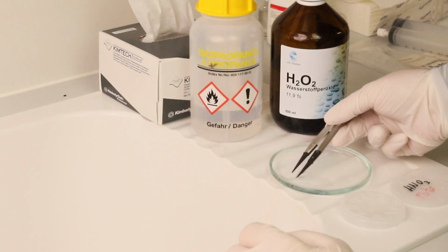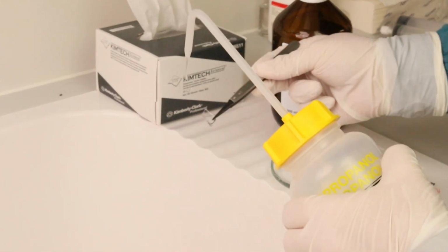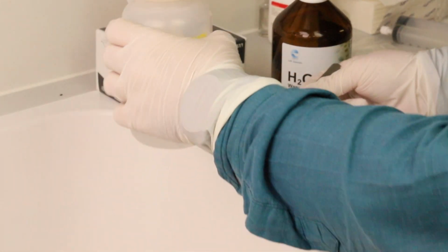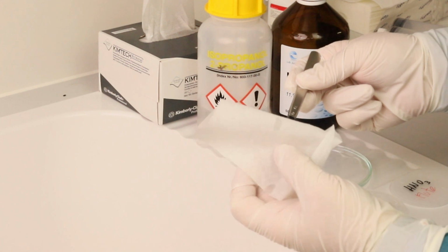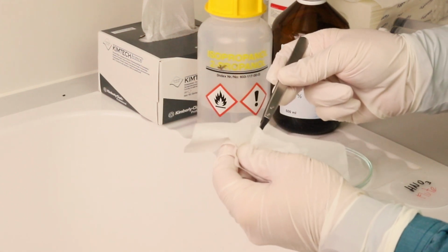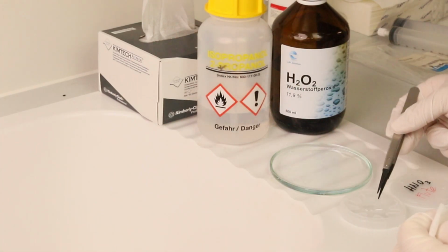Maybe peroxide and isopropanol, and using a soft tissue for drying out. And this is exactly the process I'm going to follow here. I'm going to use hydrogen peroxide, some isopropanol, and a tissue for drying it out.